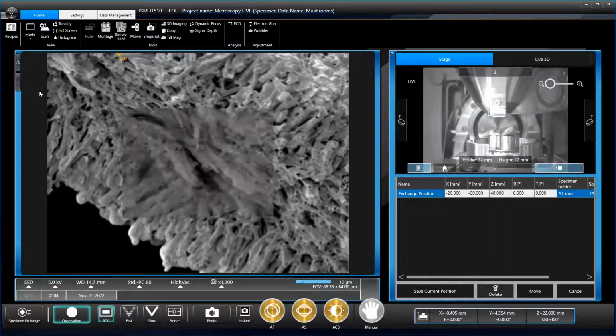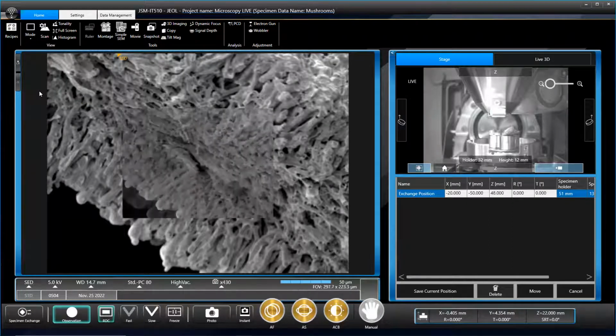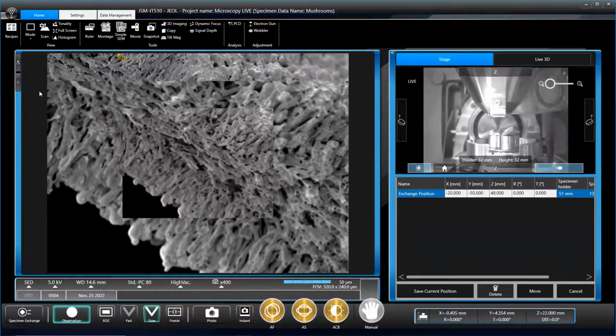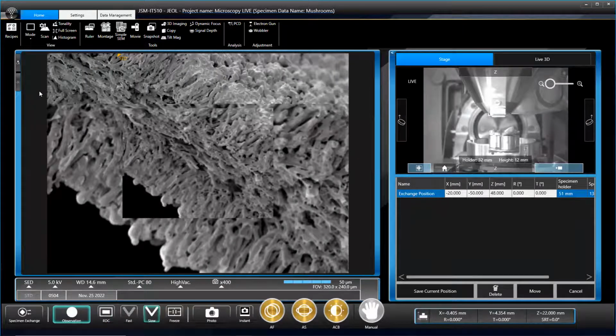So we've got these tubes again, haven't we? These ones are native to the Mediterranean. And much like shiitake mushrooms, which are named after their association with certain trees, these are also named after their association with roots of the Eryngium campestre, a type of sea holly. Apparently that's where it's found most commonly.